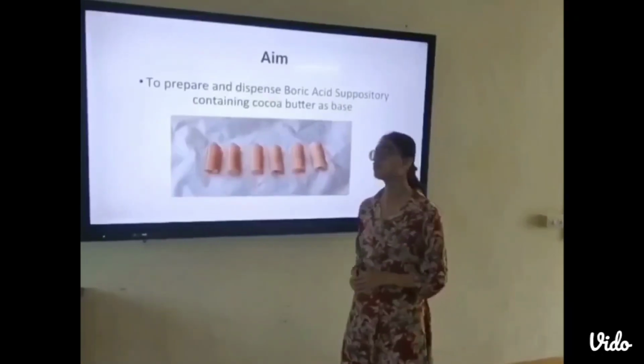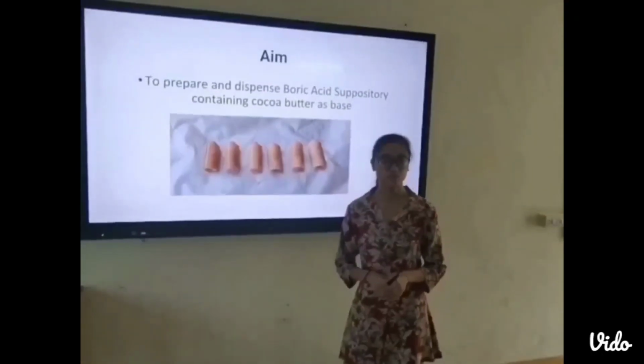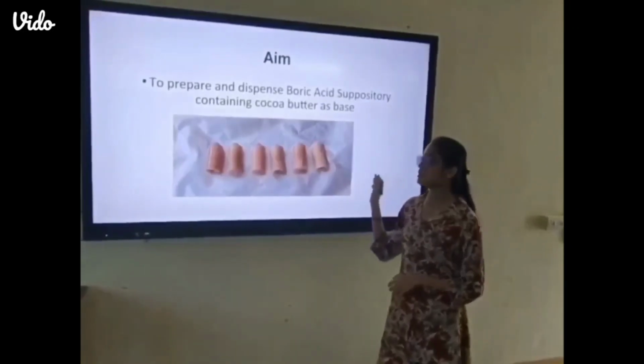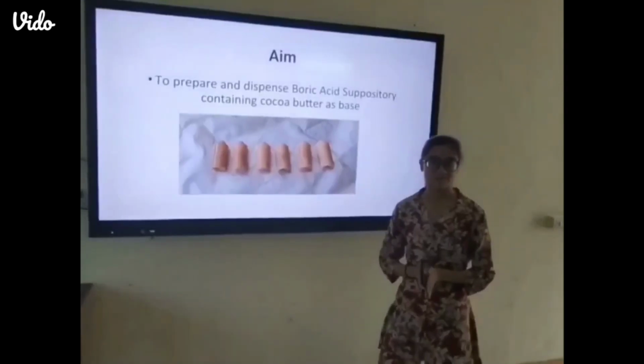Hello everyone, welcome to the practical tutorial of Pharmaceutics 1. In this video we are going to prepare and dispense boric acid suppositories containing cocoa butter as base.